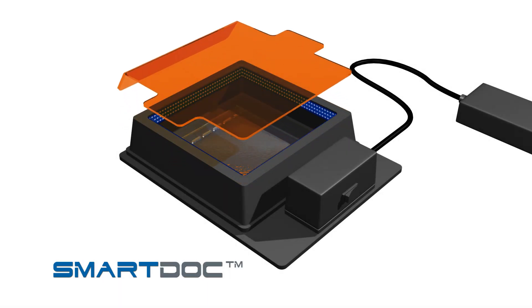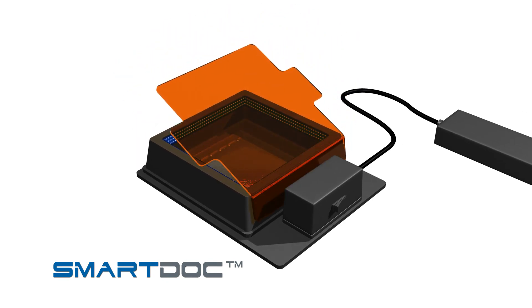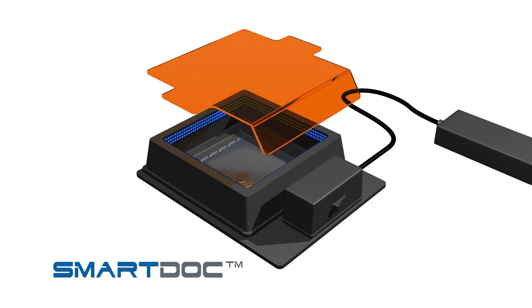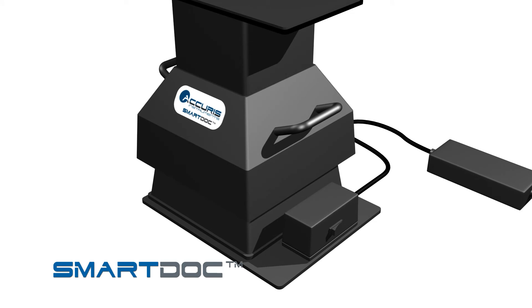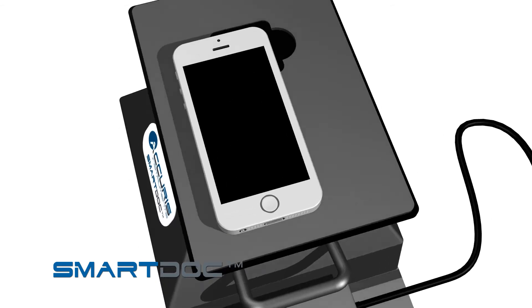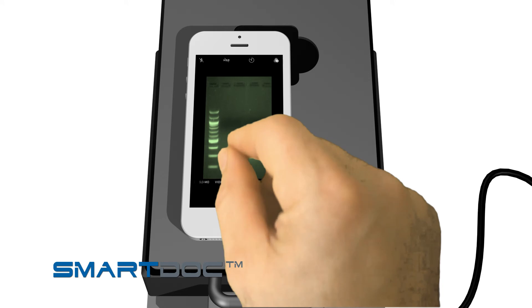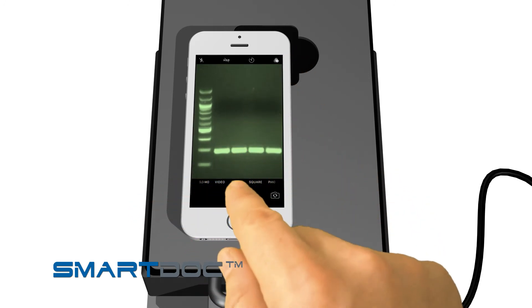To access the gel while viewing and for cutting out bands, set the cover to its angled position. To take a picture of the gel using a smartphone camera, remove the filter cover and place the imaging enclosure onto the illumination base. Insert the orange photo filter into the top platform, open your camera app, and align the camera lens with the photo filter. Use your camera's zoom and focus features to optimize the image, then snap a picture.